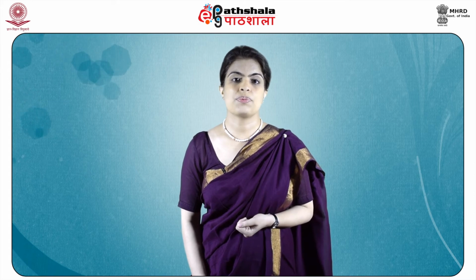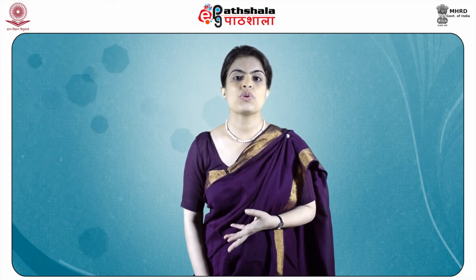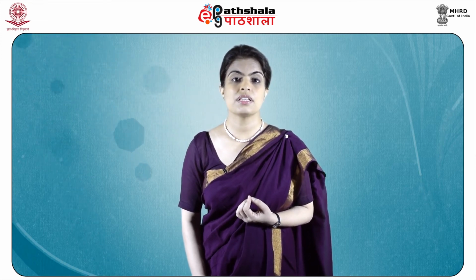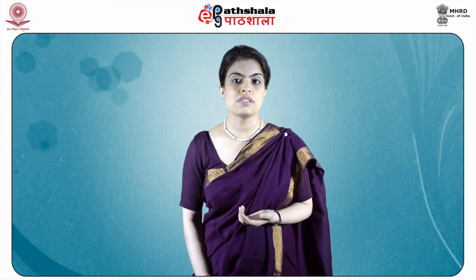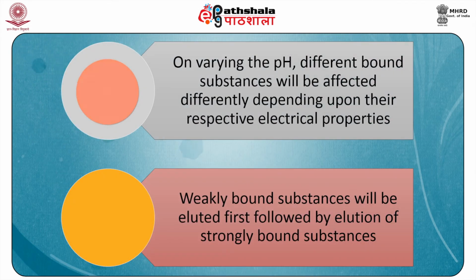Binding of substances to an ion exchange column depends on the electrical properties of the substance in question and those of the charged species in the solvent. Elution can be achieved by changing the pH in order to alter the charge on the bound substances, which in turn will affect their affinity towards the resin, or by competing out the bound substances using salts. On varying the pH, different bound substances will be affected differently, depending upon their respective electrical properties. Weakly bound substances will be eluted first, followed by elution of strongly bound substances.